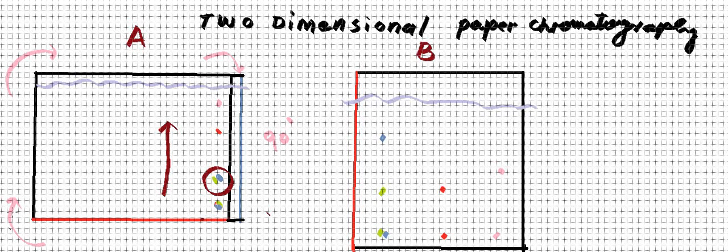What we will do is rotate this sheet of paper at an angle of 90 degrees so that these spots are at the bottom side.